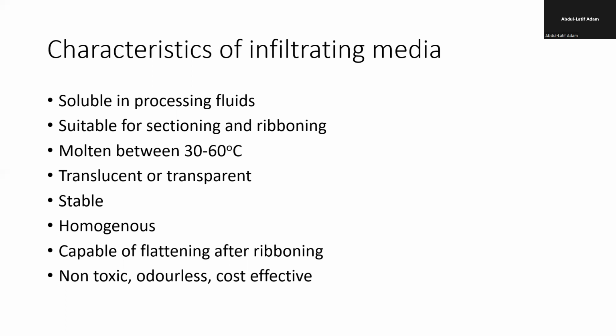Okay, and then it should be homogeneous. It should be smooth. It shouldn't have a hard part, and if it is hard, it should be completely hard. If it is soft, it should be completely soft. It shouldn't have hardness and softness together. It also affects the section. And then it should be able to flatten.